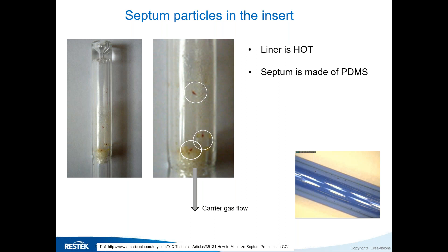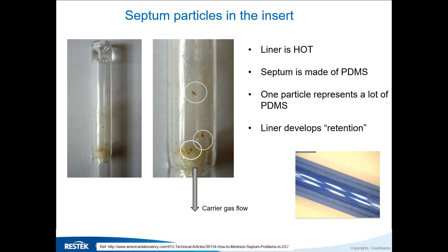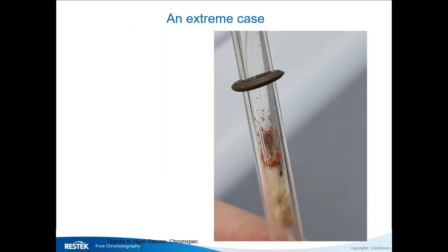There's another effect: when your analytes enter a liner that has these particles, they dissolve into the particles and re-emerge later — that takes time, which causes discrimination and differential retention. This can really impact your RSDs significantly. Precision liners or liners with wool at the top help because septum debris stays on top, and analytes are injected through the wool below it, reducing the direct impact.